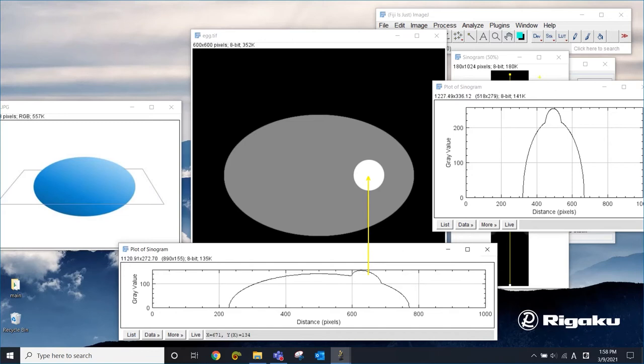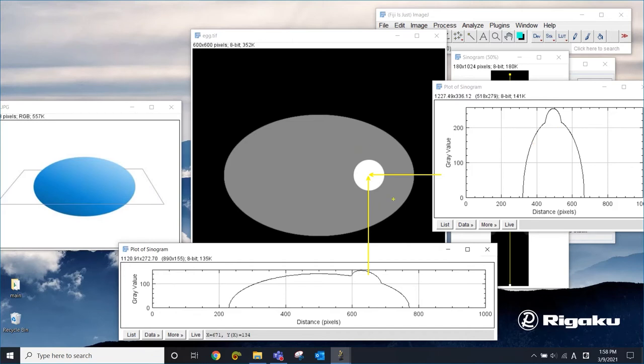And this peak here from the 90 degree projection is telling you that the high density area is in the middle of this image. So by combining those two projections, you can tell where this high density area is. So that's just two projections.